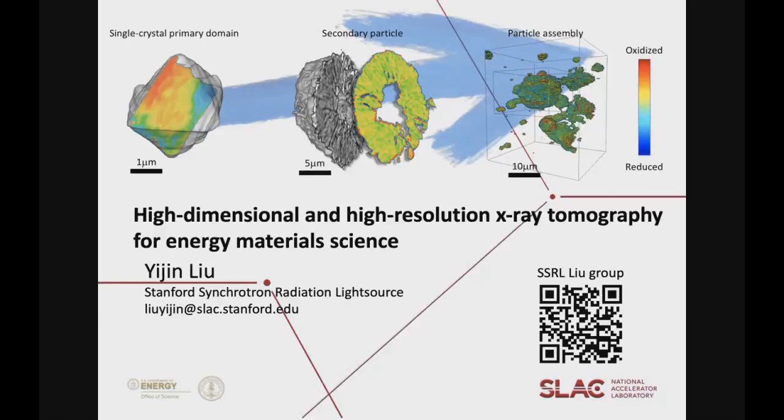Thank you very much for this opportunity to present my work on energy material science. We have been using high resolution and high dimensional X-ray tomography to tackle the frontier challenges in this field. My name is Yijin Liu. I'm from Stanford Synchrotron Radiation Light Source.